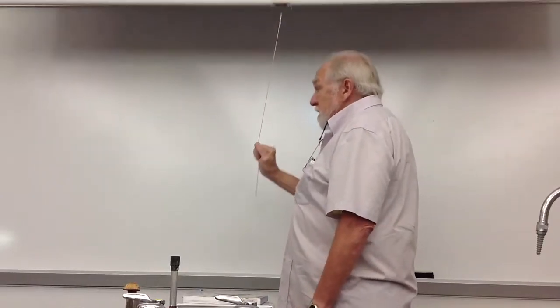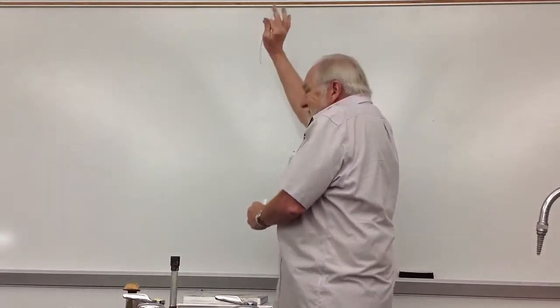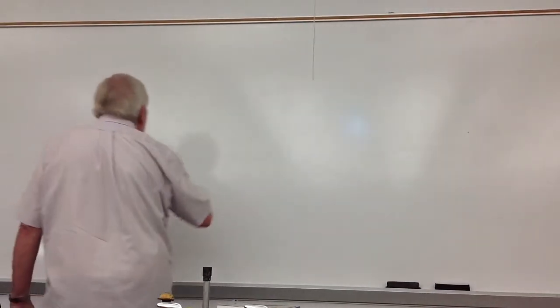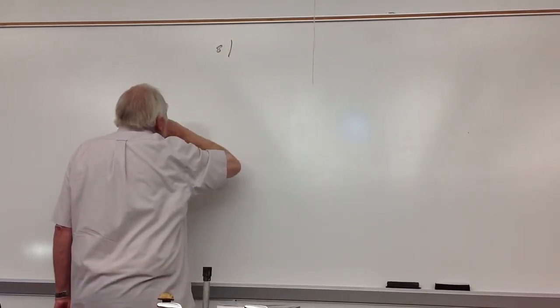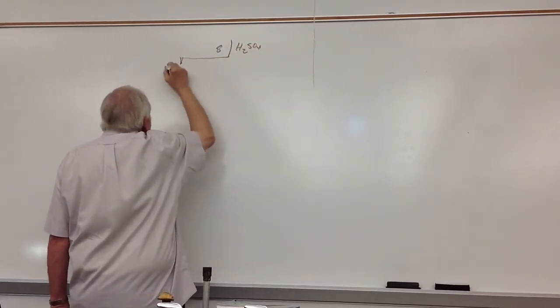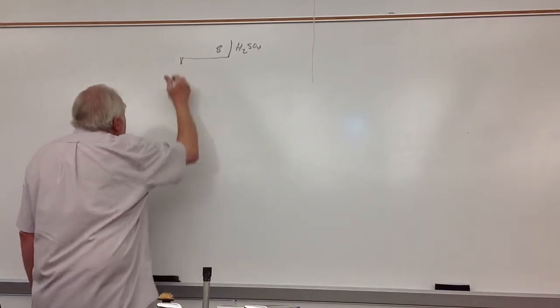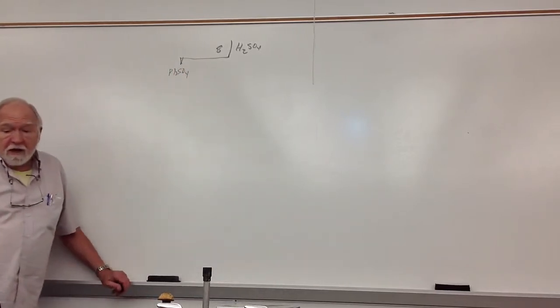From, and this is one of the things people lose, because they don't know where to get the decantate for procedure 9. What we did was procedure 8, and we did the H2SO4, and we got lead 2 sulfate. And we continued with the confirmatory test for lead.